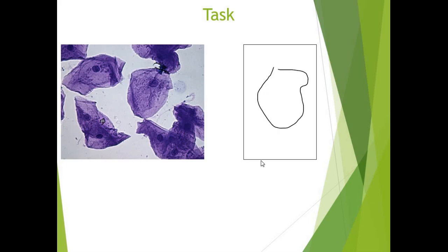You can kind of see, again that's very poor, I've been doing it on my mouse, it should be better than this. The key point you should be drawing is the outline of the cell membrane, and you should be drawing the cell nucleus, and then you should really only have 3 labels, and they should be the nucleus, the cell membrane, and the cytoplasm, because they're the only organelles that are clearly visible from here. You should have your title, you should have the magnification. Now I know you don't know this now, but this is what you should end up with, something like this.